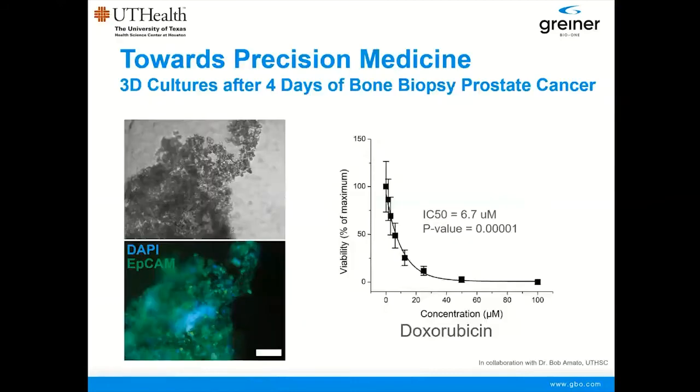And here are the results of patient samples. This was a collaboration also in Houston with the University of Texas Health Science Center in Houston. And we took a small biopsy. This was a bone biopsy of a prostate cancer metastatic site.